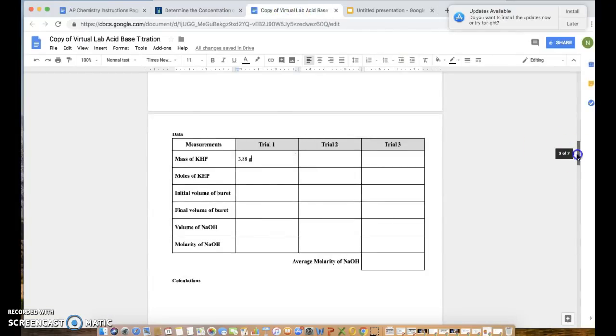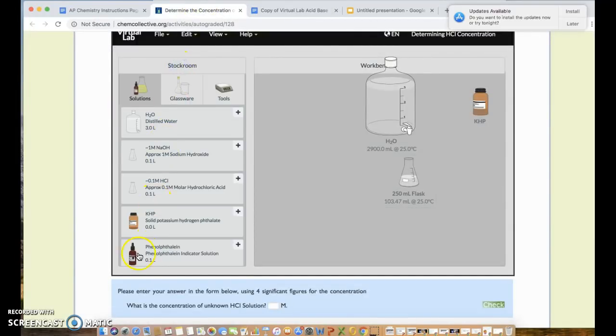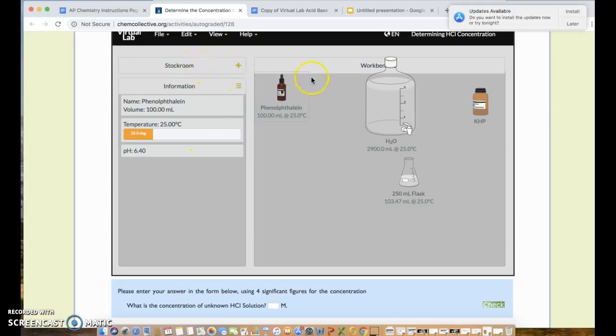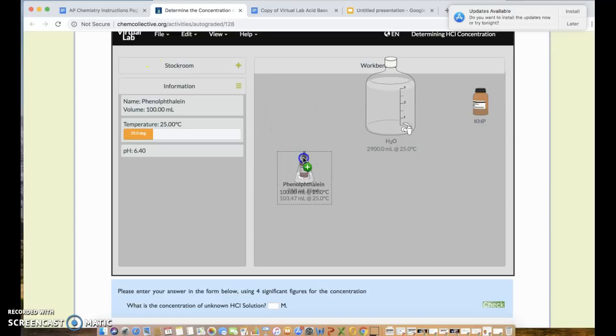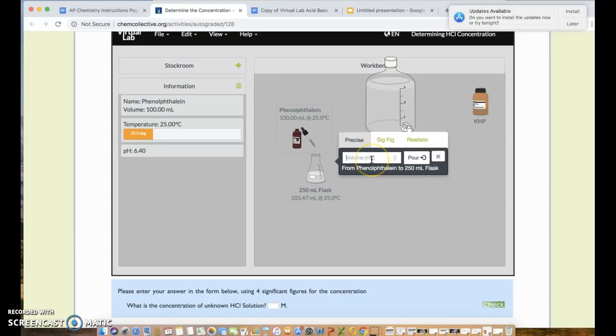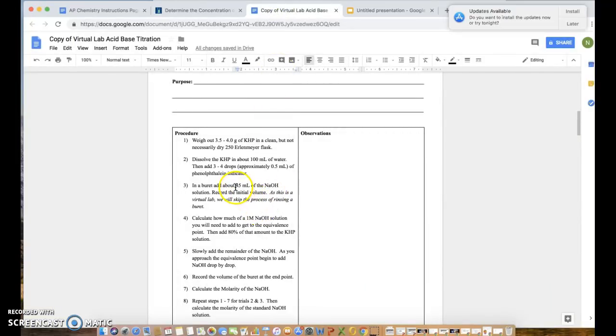Phenolphthalein is the indicator — it turns pink when the acid-base solution is neutralized. Get the phenolphthalein dropper bottle from Solutions, drag it on top of the flask, and add 0.5 mL using the precise method. The bottom of the screen confirms that 0.5 mL has been transferred. Then close that down.